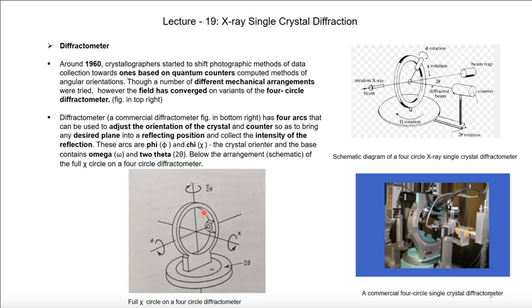People are now using the diffractometer in almost all solid state laboratories to collect single crystal data for 3D structure determination.